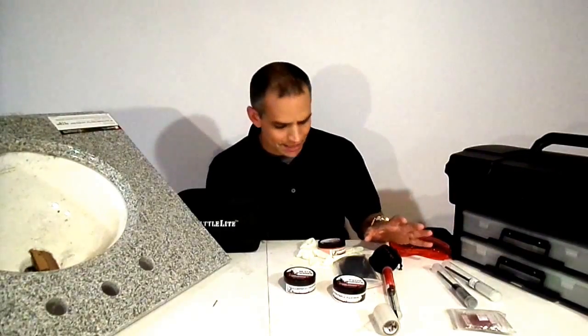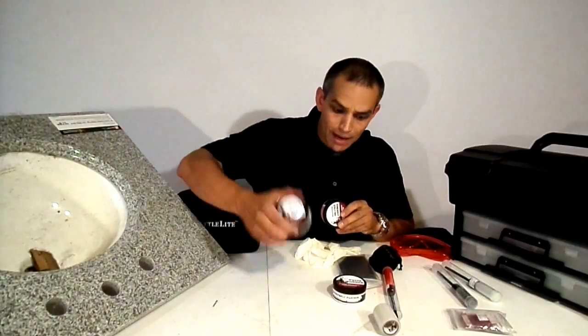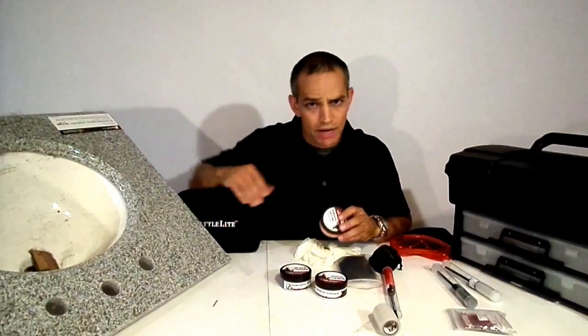Hi, welcome back to Forensic Education. I'm Mike McCutcheon and I'm going to be your instructor for today. I'm really excited to get to today's lesson because I can answer a question that I've been asked several times but haven't been able to demonstrate: when to use fluorescent powder over a traditional black powder, white powder, or gray powder.